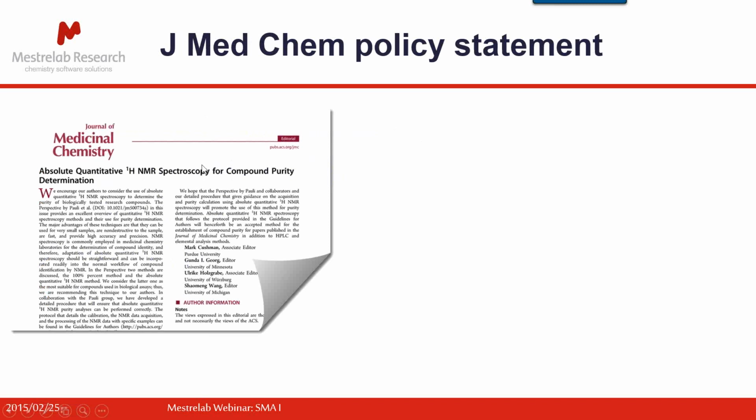Okay, so I think this applies, in my mind at least, not only to journals like Med Chem, but I think it really ought to apply to any organic chemistry journal. And I've seen papers in JOC and lots of others where the people have chosen to use purity by NMR as a way in which to specify the purity of the compounds that they've isolated and produced.